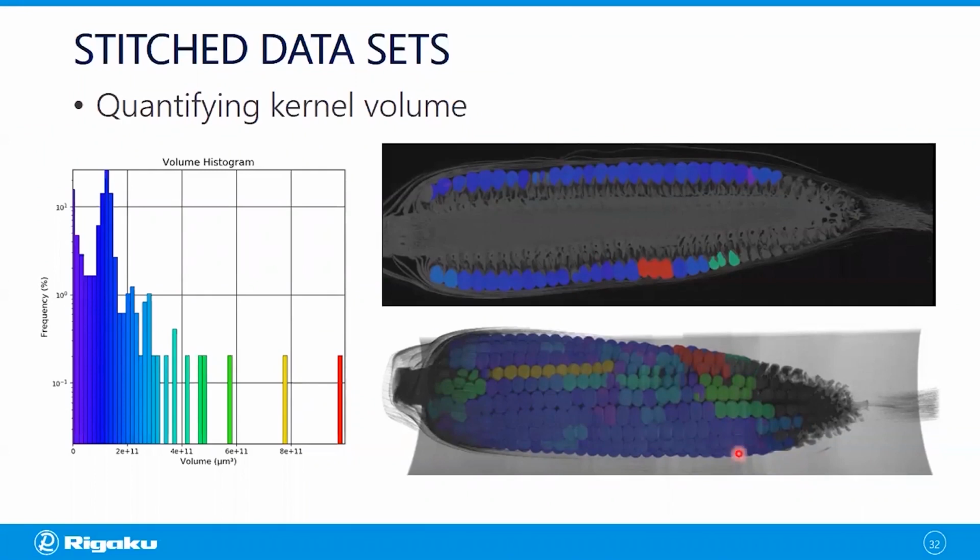So you can see that we can ask a number of questions about the sample once we have a full image to evaluate. We could also ask questions about the corn silk because we can see it quite clearly, or we might ask questions about the corn husk itself. So lots of things to explore here.